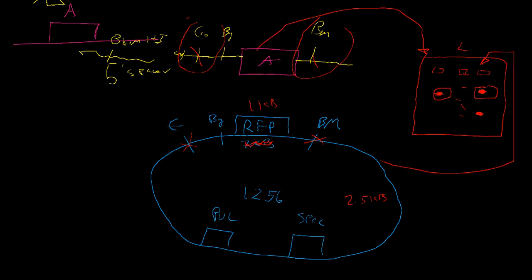There's a tutorial on how to do that, and we can clean them up, and then we just end up with just this chunk, so none of that extra stuff, but just what is inside of this circle, or actually, wrong circle, let me change colors. So after gel purification, we end up with just what's inside of that green circle. Bad contrast, let's try blue. Just that, that's a little bit better.